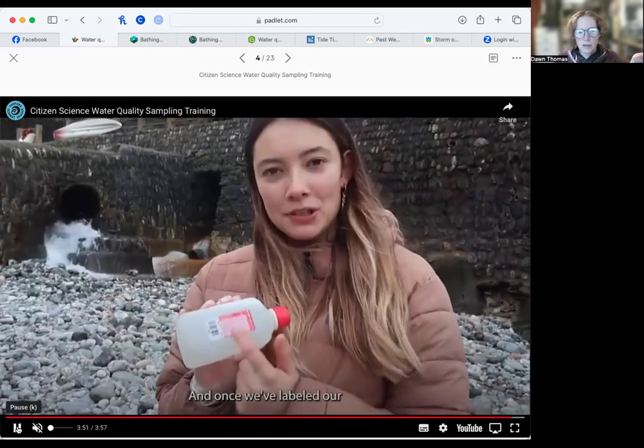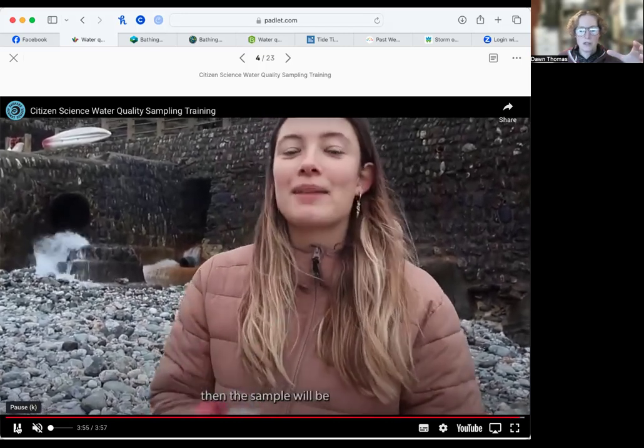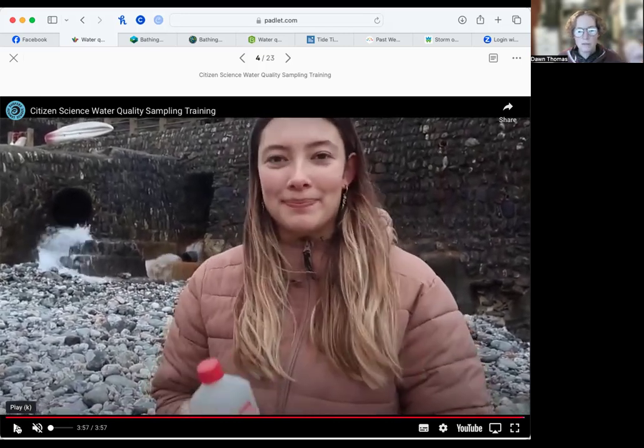We've got paid-for postage labels. If you can't find them, look in your pack. You've got an insulated bag, and there's a little zip pocket sometimes. Look in there, in an envelope, if you can't find your labels. Stick that onto your sample pack.